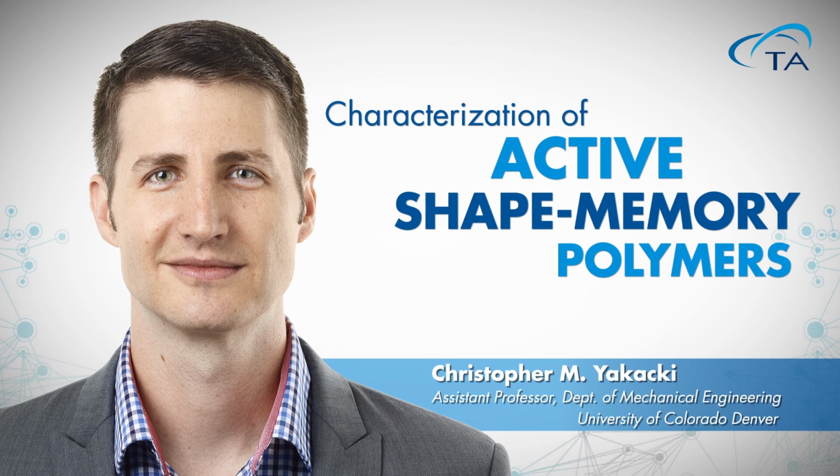Oh, and here we go, it's pulling up for me here. If you have no tan delta, it's just a nice linear line. You never have to worry about it. There's no hysteresis. But when you have a material that is somewhat viscoelastic or viscous, you'll get that loop. And one key difference between the two pieces of equipment to keep in mind is that the ElectroForce machine allows you to capture those individual waveforms and export that as its own little file. So I don't know if we can advance the slide here to show how I captured it.